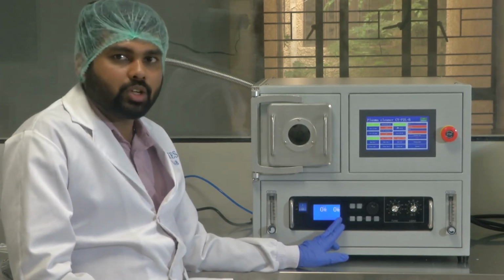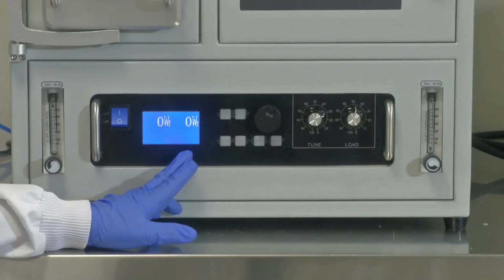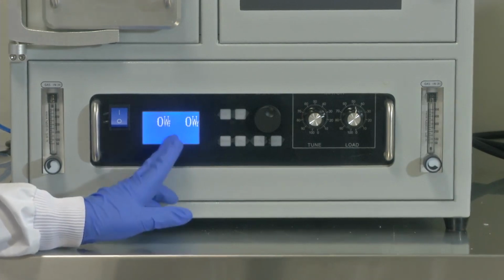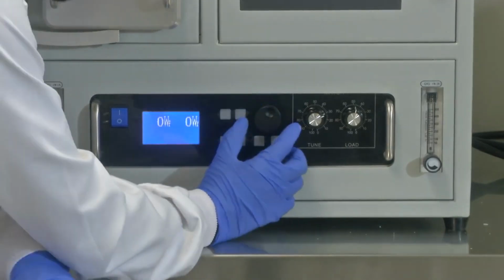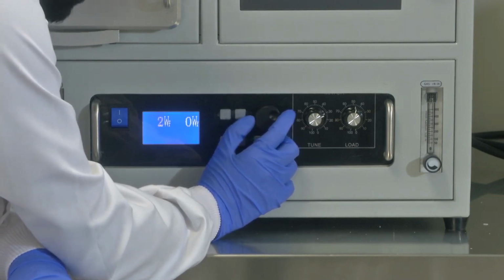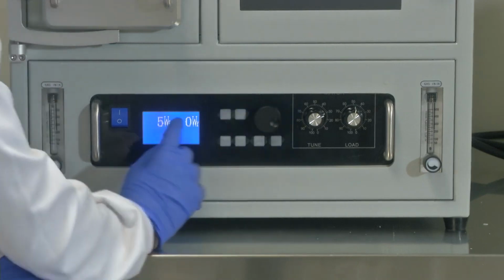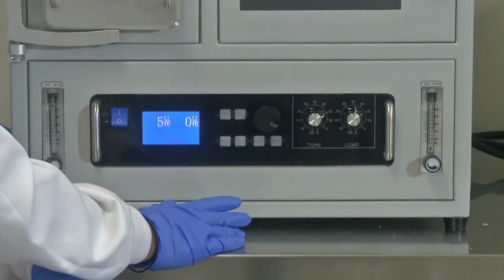Okay, let's now focus on the RF control. Now it is 0 forward watt and 0 return watt. Now this is the knob to adjust the RF power. So let me increase the RF power. 1 watt forward, 2, 3, 4, 5. So return power is not there. So this is good condition. So it is tuned properly.